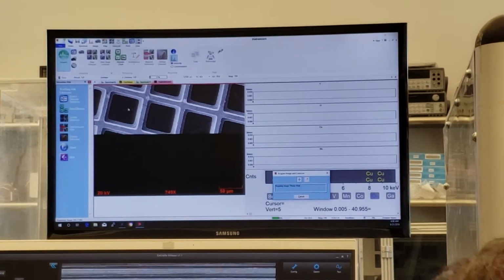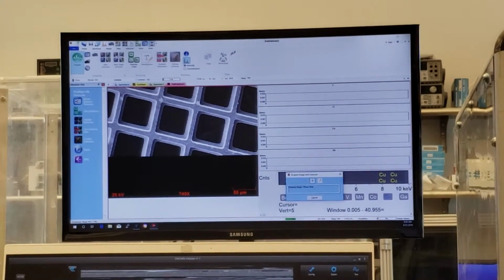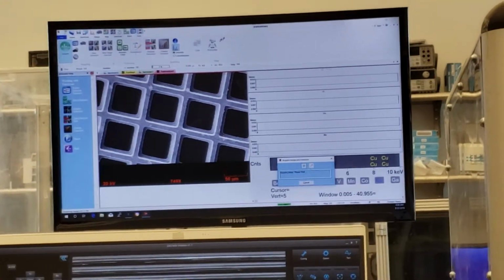But it drops down the SEM image first. It seems to have pretty much stabilized for us too now, Alex, after we reset it. Yeah. I think initially it was the outgassing of the alcohol.